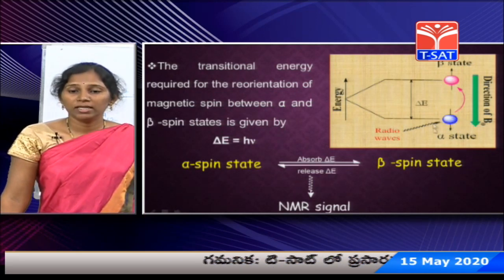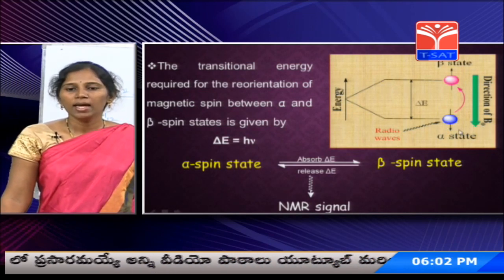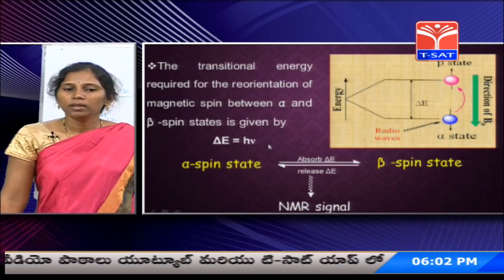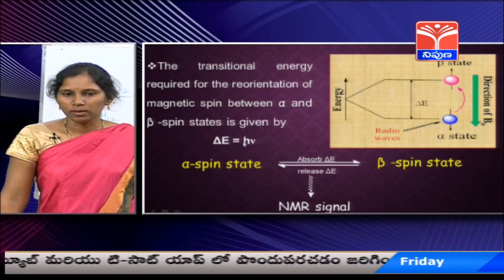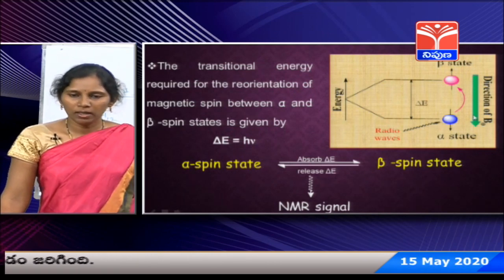Remember that the precessional frequency depends upon the strength of the external magnetic field, and which is equal to the frequency of the radio waves. Here delta E depends upon the strength of the magnetic field also.